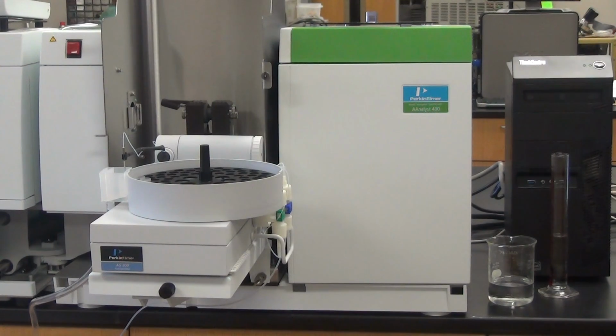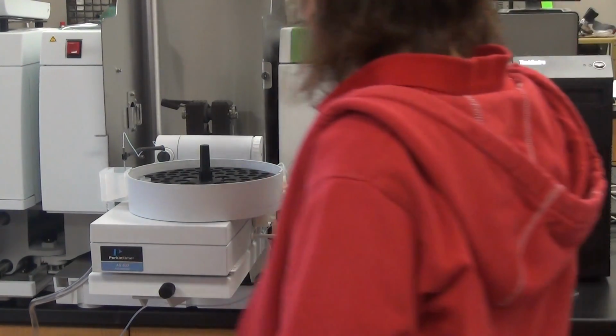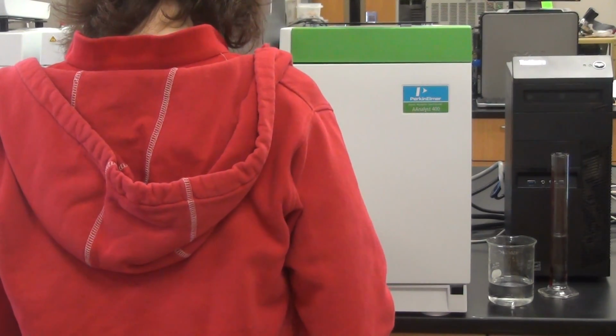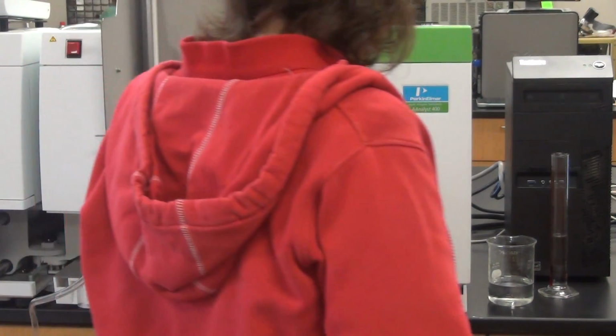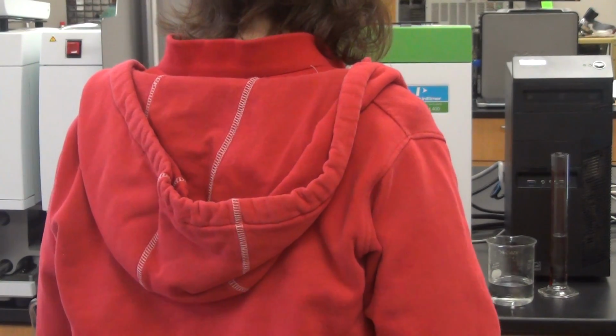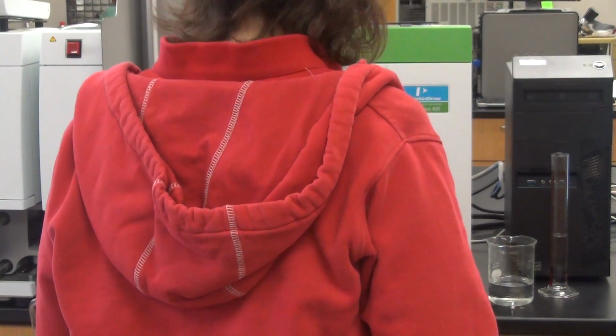And as I had a sample information file, if I go to analysis and I go to sample information file, I want to say sample number 1 is location 12 and it's good.